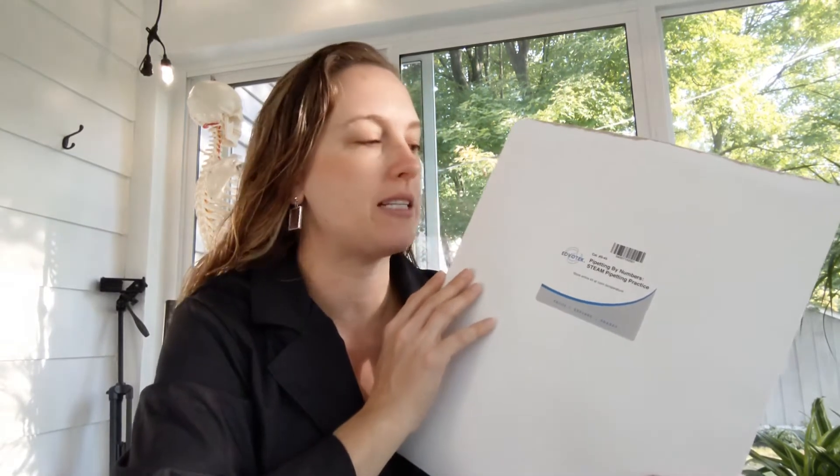And it's meant to be done before the students load their gels to give them some practice with pipetting. But if you teach one of the upper level biomedical science courses, or you don't teach biomed PLTW, but you want to do pipetting practice, this is available on Edvotech's website. And there are a couple different versions, which I'll talk about toward the end of this. One is more advanced than the other.